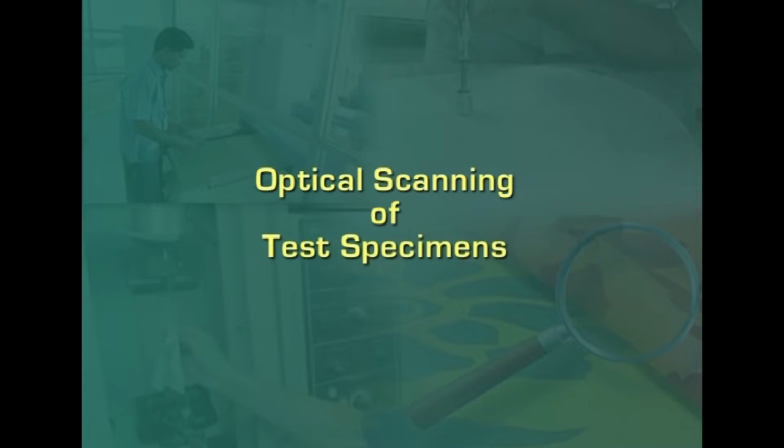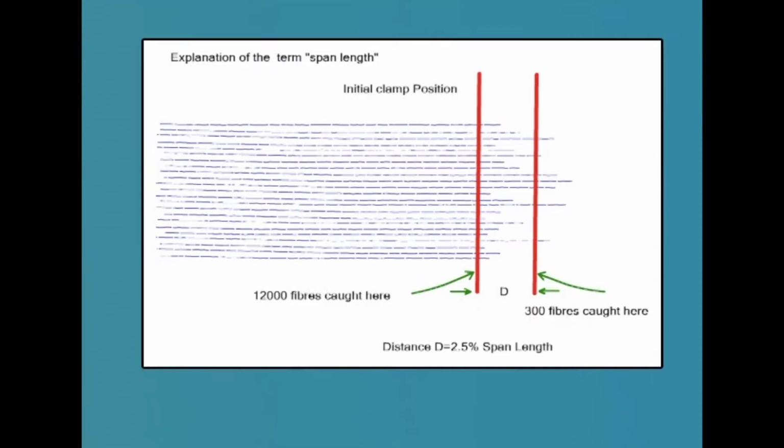Now let us have a look at the optical scanning of test specimens. Loaded pair of combs are inserted into the comb holders and fibers are brushed carefully to remove loose fibers not held by the comb base, and the rest are straightened. Either the fiber combs are moved into the light zone in the HVI or the light house is lowered in the Fibrograph. The fiber bed is scanned photoelectrically from base to tip.